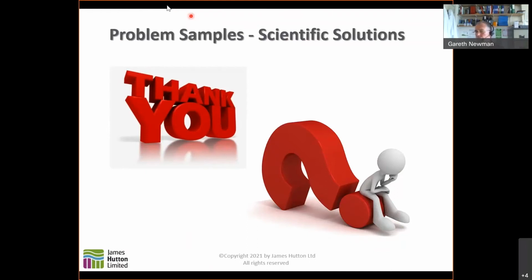For heavier organics, we've got things like LC-MS-MS and HPLC. And we also have an isotope section: continuous flow isotope ratio mass spectroscopy, carbon-13, carbon-12 ratios, and N15. And quite uniquely, well, probably not uniquely, but rare, we do have a thermal ionization mass spectrometer as well for doing strontium, neodymium, samarium ratios and strontium isotopes for stratigraphy interpretations, plus many bench techniques, wet chemistry and physical techniques as well.